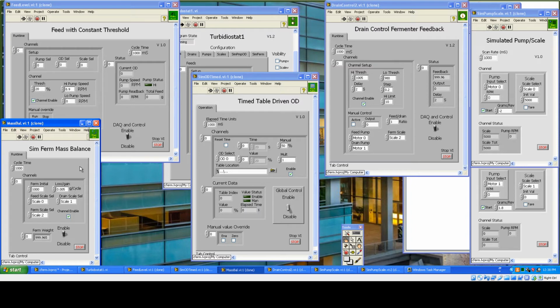Now let's make this gain a little bit instead of lose a little bit. The reason to do this is to ensure that our only source of extra volume and weight is the feed. And so the only thing we can do if the fermenter gets too light is to just not pump. So let's put it positive so that we can regulate a little more positively.